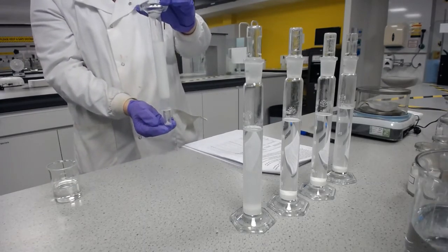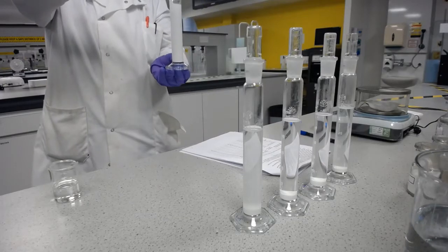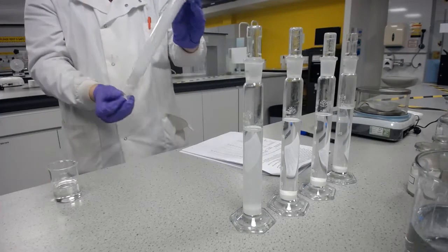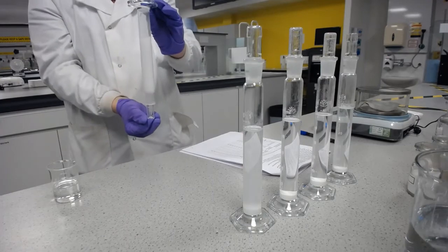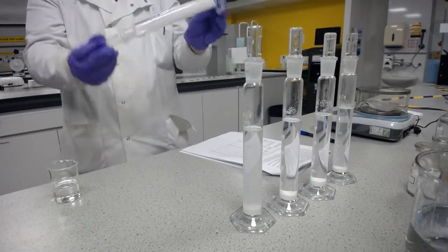There we go. 5, and you can see we've still got the powder on the bottom there. 6, 7, 8, 9, 10, 11, 12, 13, 14.